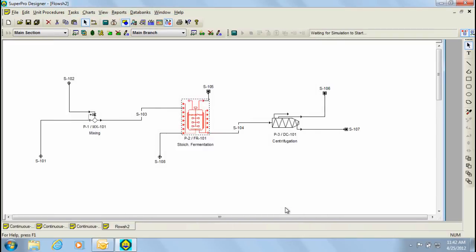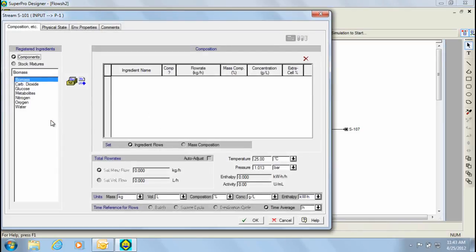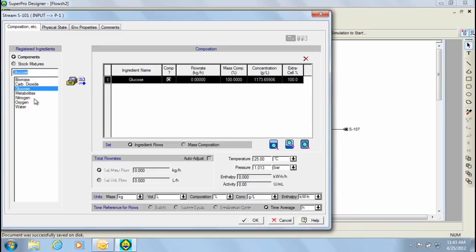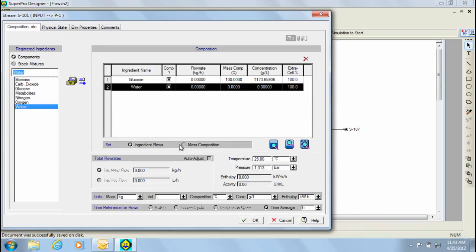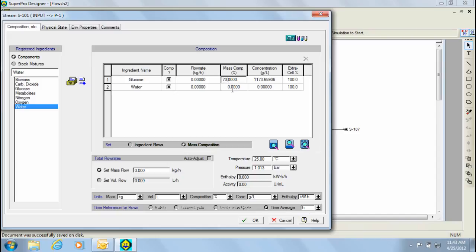Another notable difference is that in continuous processes there are no charge or transfer operations, so we initialize component addition directly in the stream by double clicking on it. For instance, we can initialize the concentrated glucose feed stream by double clicking here, and then specifying the details through this dialog. This stream will consist of glucose and water with a mass composition of 70 and 30% respectively. Furthermore, we now have to specify the mass flow rate, which is going to be 1000 kg per hour for this example.